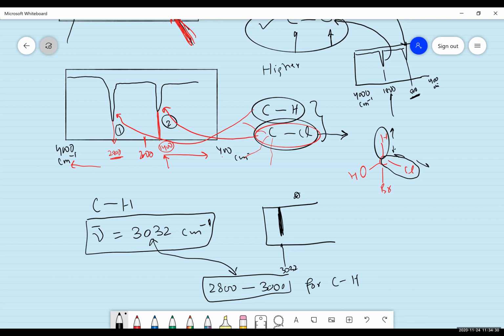Yes. For a ring structure, it changes. For example, aromatic CC bonds vibrate at totally different values, and aliphatic vibrate at different values. We have a table of values which gives us some number, and we can use that table and apply that information to calculate the presence of different bonds.